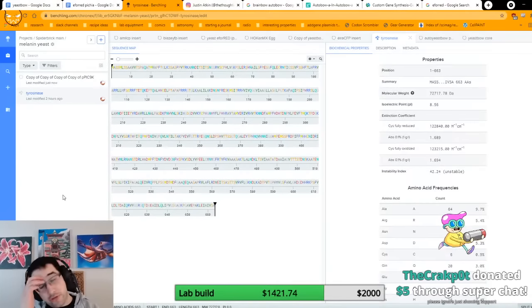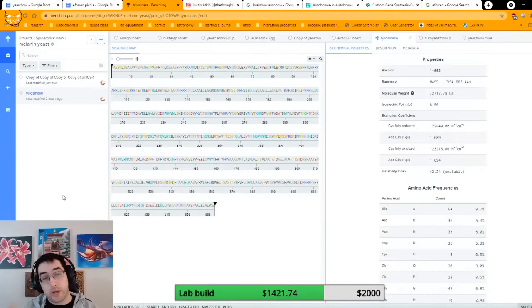So I think it's just interesting, really. I also want to compare it. The reason that my friend was working with this in the first place, and the reason I was even thinking about this, is he's making rainbow flowers by expressing different chromoproteins in them. But he wants to make it CMYK, and so for that shade value, he's going to use melanin. So he's making this, which is melanin production, presumably in the flowers, to make the first true black flowers.